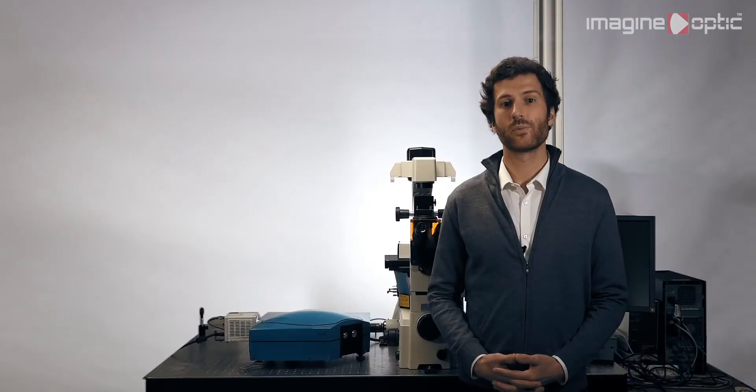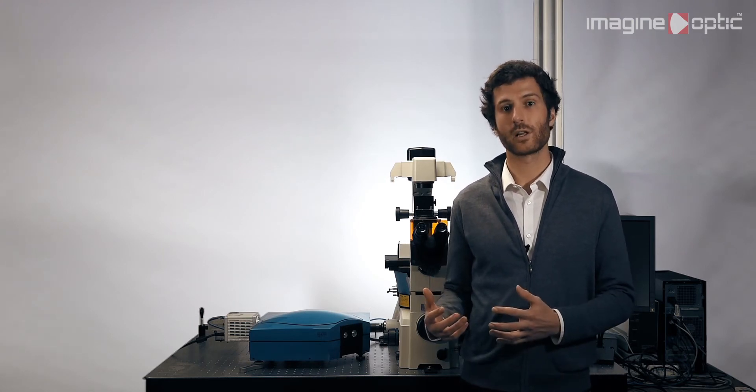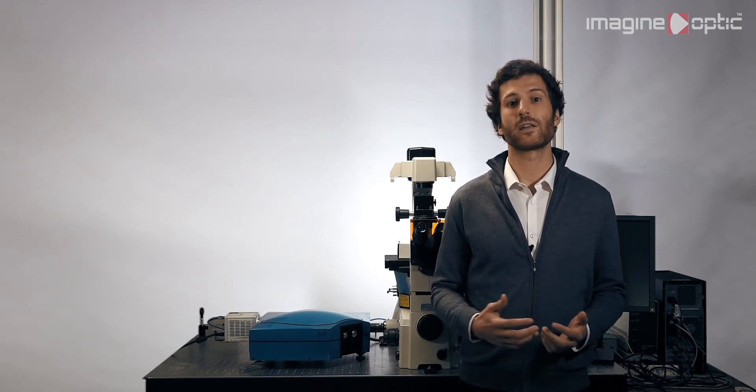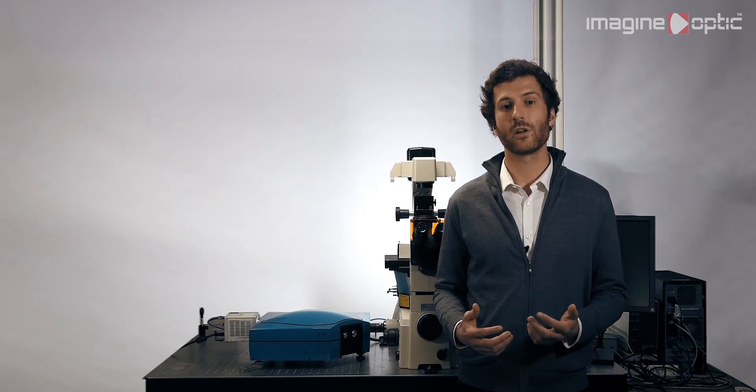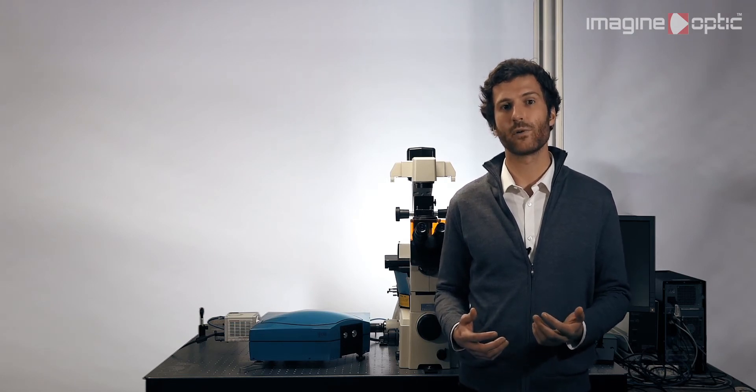This video aims to present the Mikao device to show how it works, how it can be easily implemented, and what advantages it offers to single molecule localization and spinning disk confocal microscopy.